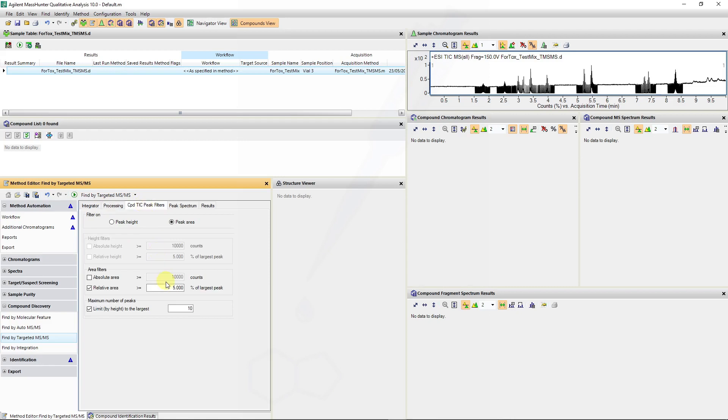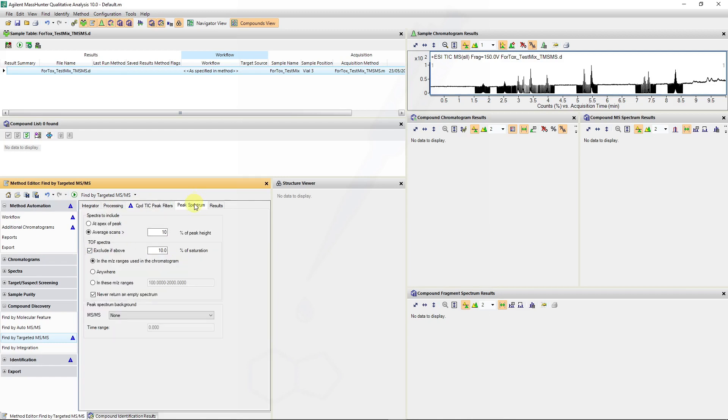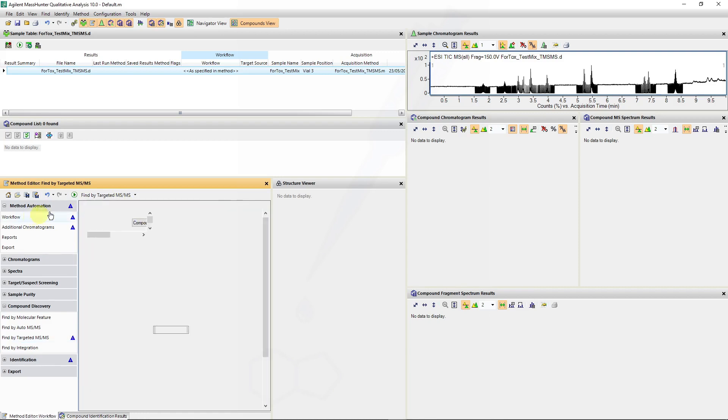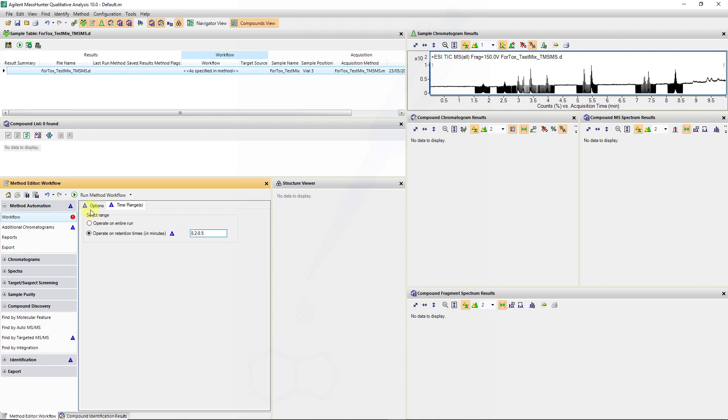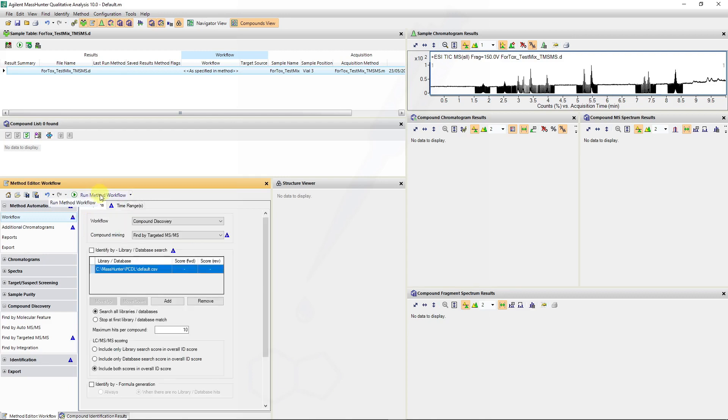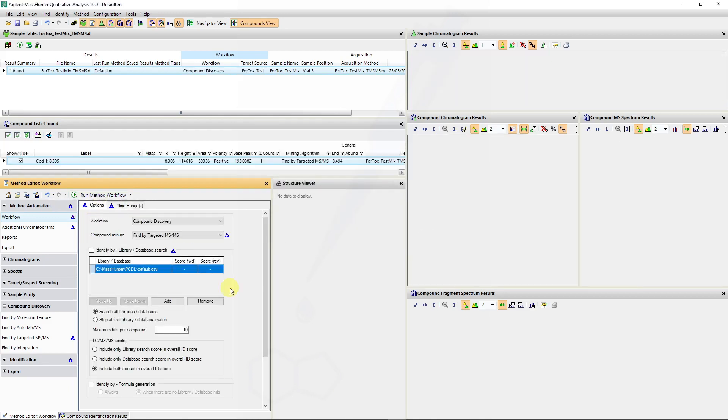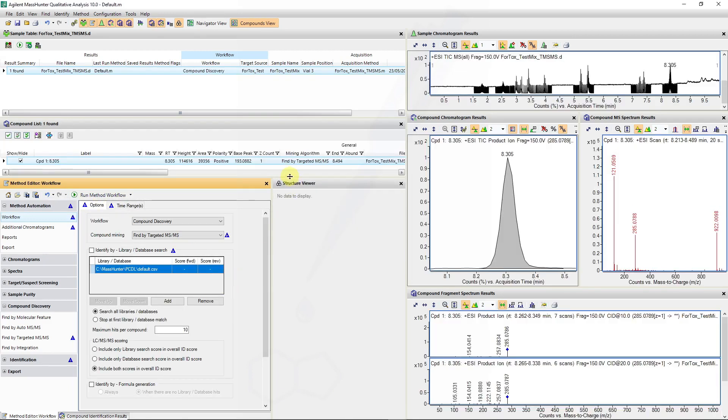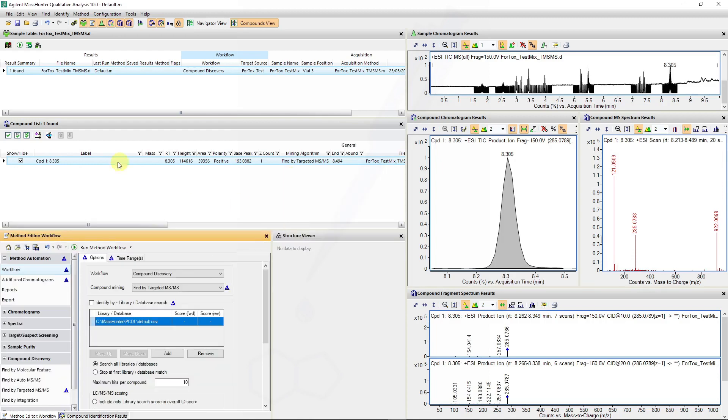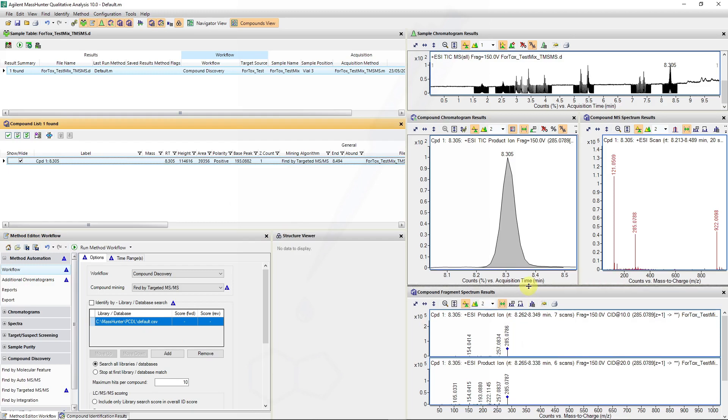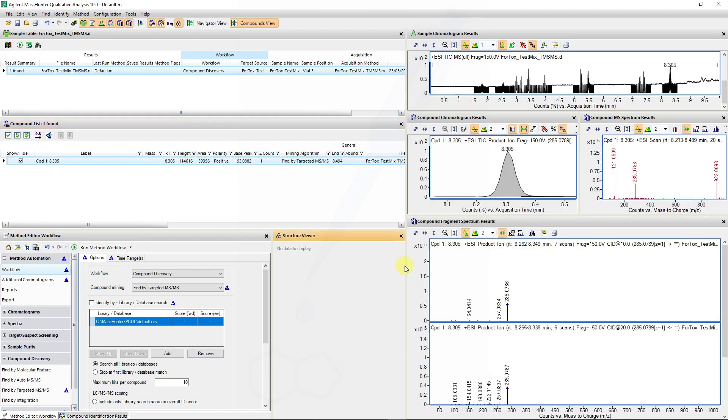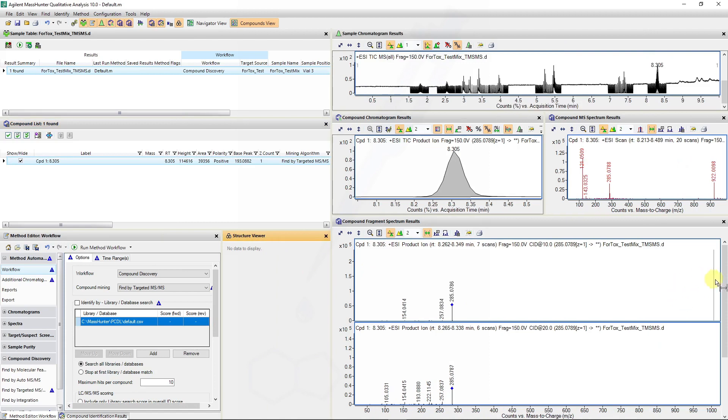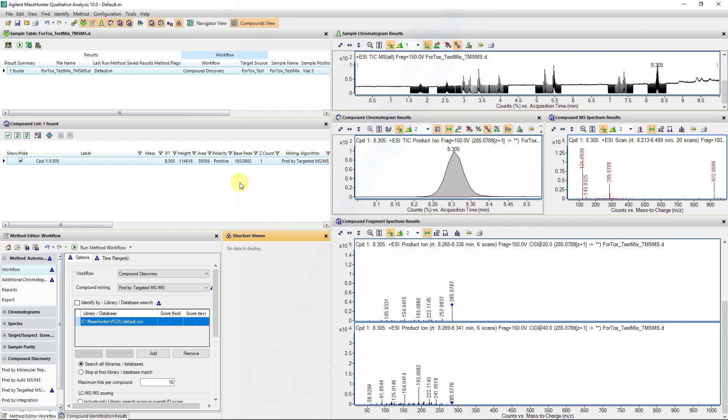These default values are good. And I will also limit my height by 10,000. The extraction of the spectra will happen at greater than 10% of the peak height, and it will not include saturated spectra. So if we then focus our workflow on that peak between 8.2 and 8.5 minutes, we should be able to generate an entry targeted MS-MS entry for that 285 peak. And now you can see there's certain spectra associated with that targeted fragmentation at different collision energies.